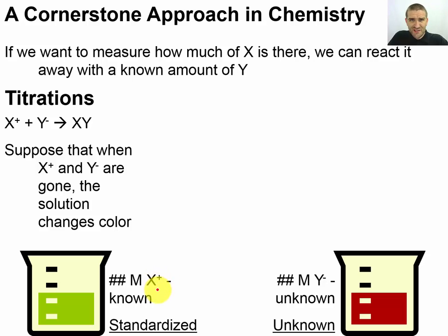that doesn't drift. Some things will react with oxygen in the air. Some things have problems with other molecules being around and slowly react away, or they start sticking to the glass, or they're hard to measure because they get waters of hydration. All these things are terrible when you want a standard. You want something that's really well behaved and really simple, and ideally really cheap. So that's one of the reasons we use hydrochloric acid so often. It fills those roles very nicely, so HCl is great for this sort of thing.